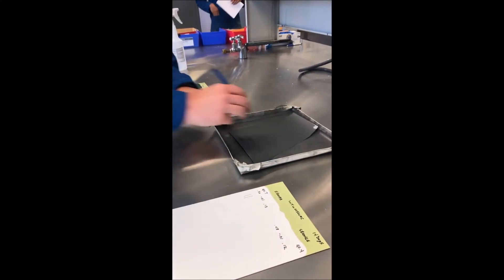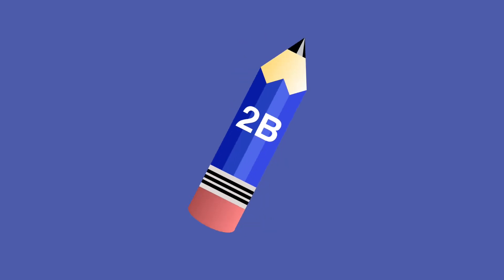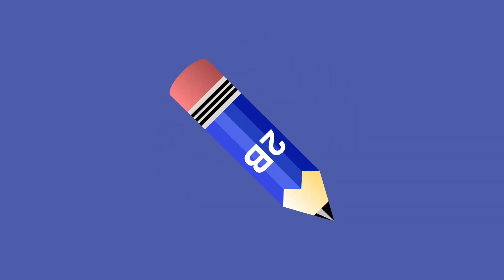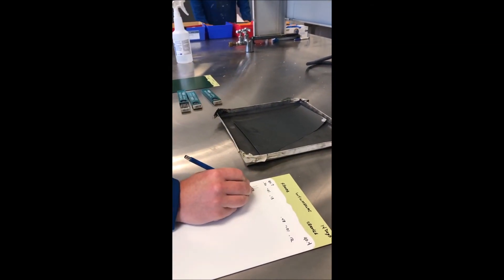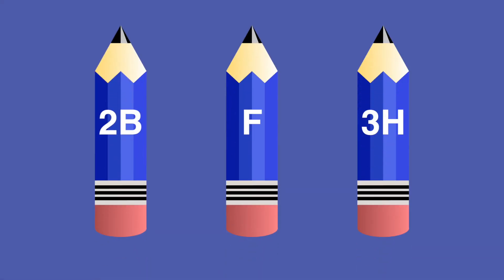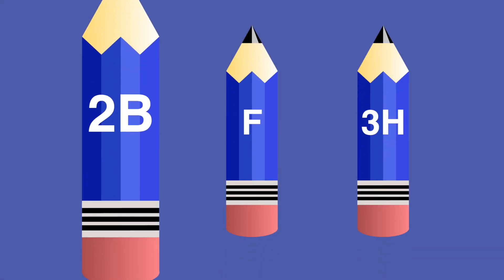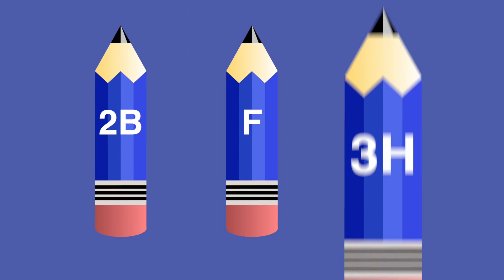Place the panel on a flat surface and select a pencil. The selection could be a lead with a value that is harder than expected or softer — experience makes little difference. Hold the pencil at a 45-degree angle to the panel. Simultaneously apply a downward and forward force in an effort to nick the surface of the coating. It is recommended to push the pencil forward with an arm motion rather than using just your hand or fingers. This will help to maintain a 45-degree angle. If the coating is nicked, select the next softer pencil lead and repeat the test. Likewise, if the coating is not nicked, select the next harder pencil lead and repeat the test.